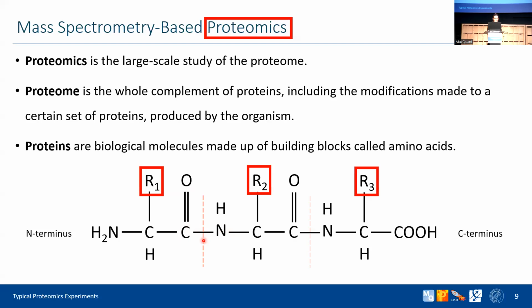So that's quite basic. And I gave a very abstract definition of the proteome here. Of course, this definition means that when you say proteome, you mean all the proteins of an organism and all the modifications that you can have in these proteins. But for the rest of the week, when we are talking about the proteome and when we are discussing a proteomic experiment, we actually are going to talk about the sum of the proteins that you have in your sample, and that's it.